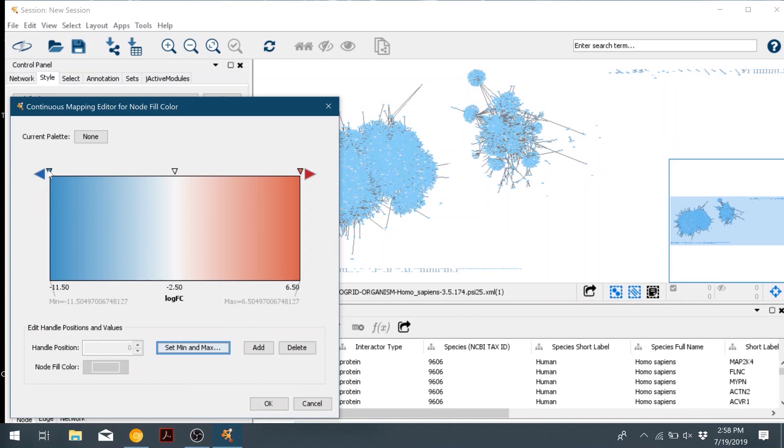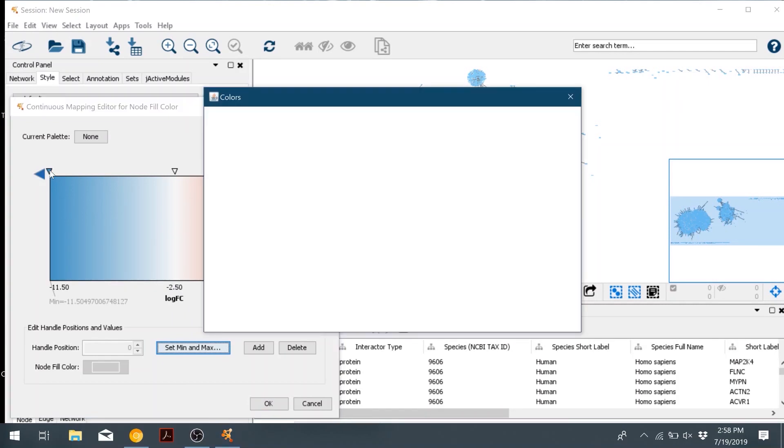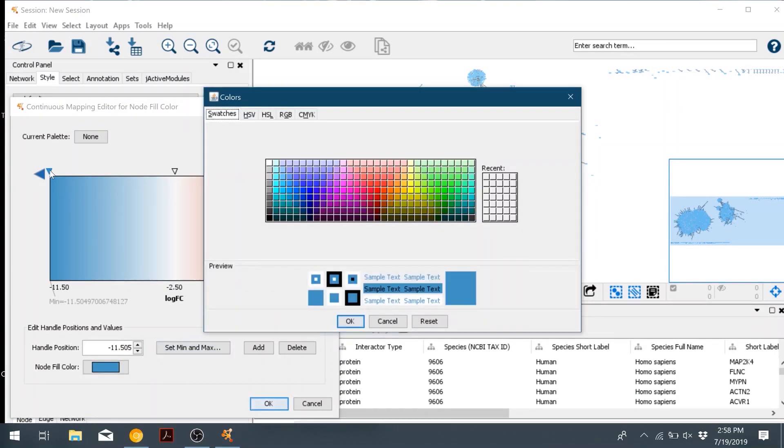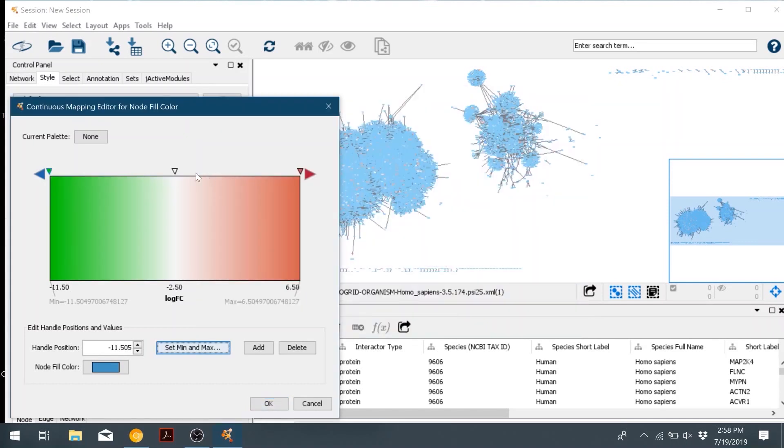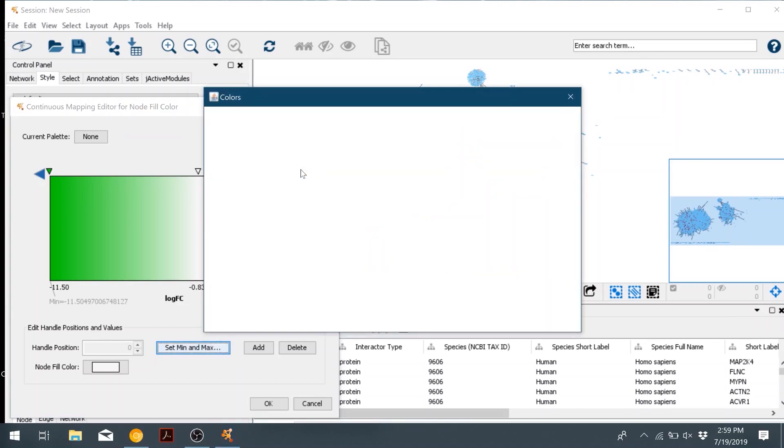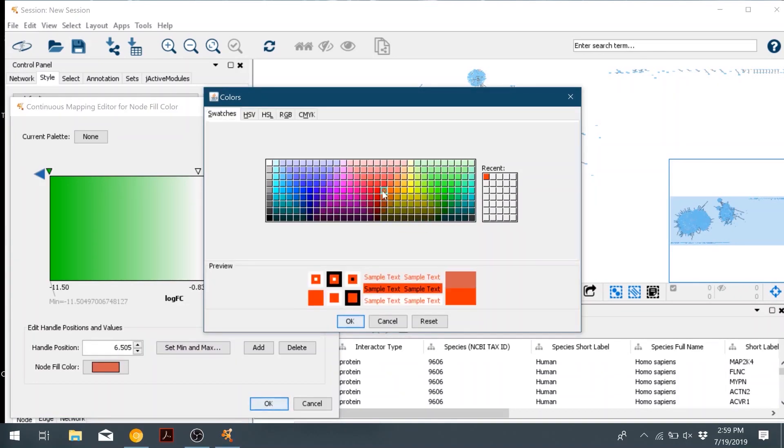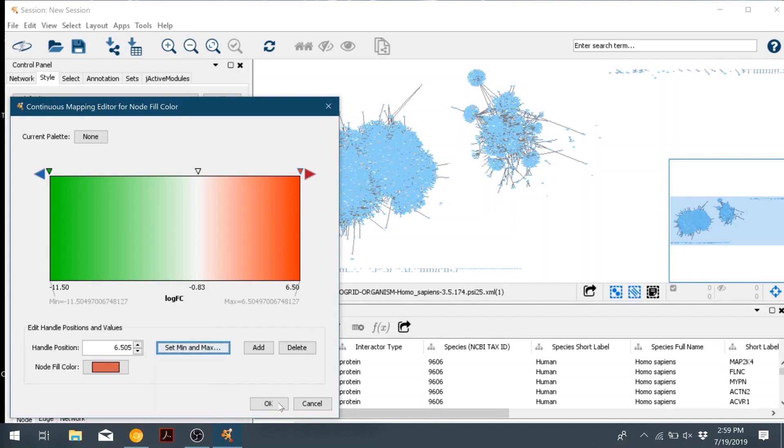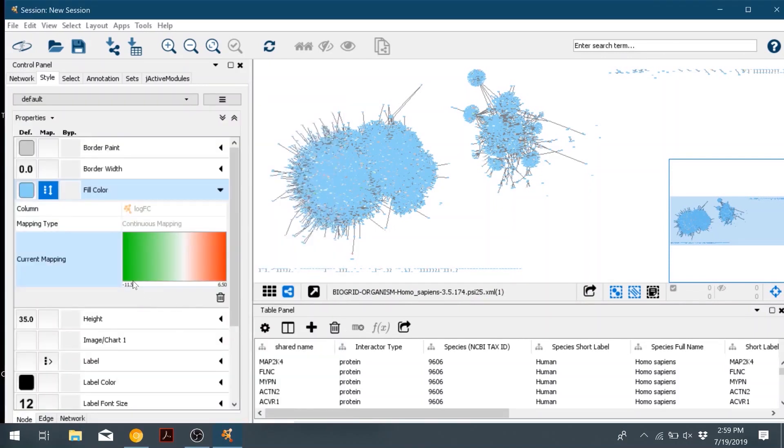And then to change the colors for the gradient, double click the arrows on top. I'll change them to green and then red. Then any nodes or proteins that were not in our differentially expressed data set that we added will remain blue.